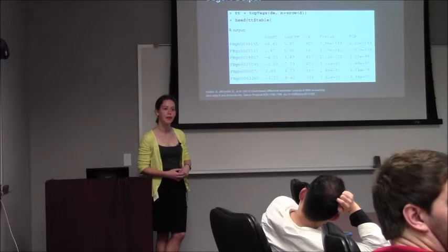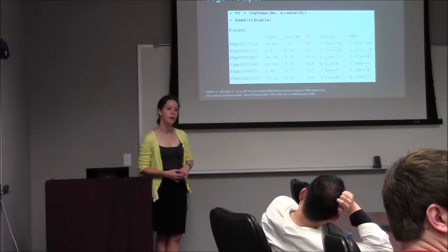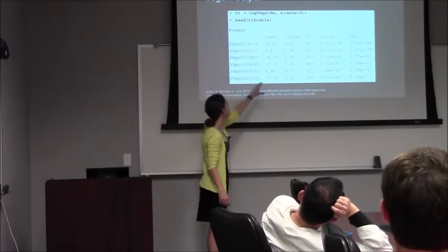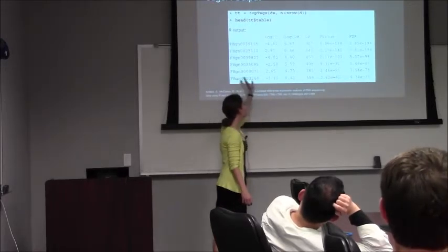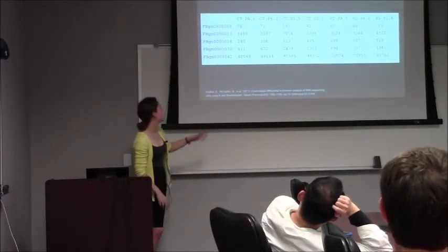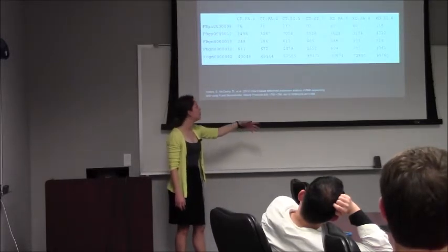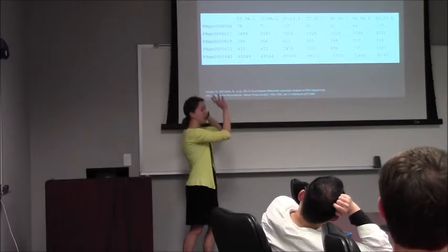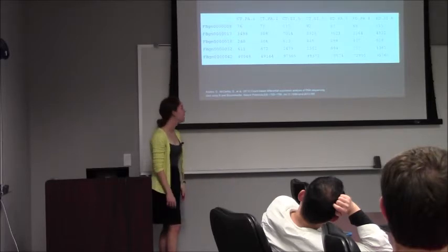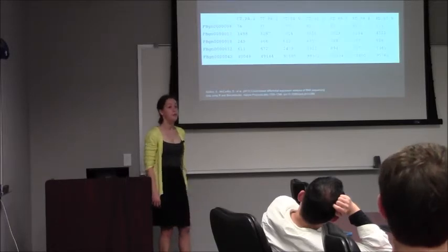So are the genes multiple response variables, or do you have a coefficient in the model for each gene? You can actually do a test for each gene. There is a sequence of counts, and let me go back to the data. Yeah, there's one gene and then a sequence of responses based on however many samples you have. I imagine you could have this go farther and have more than the 6 or 7 that I put on the slide. So the test is for just one gene, whether it's different between groups? Mm-hmm.